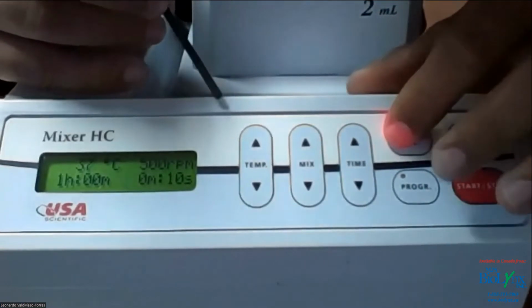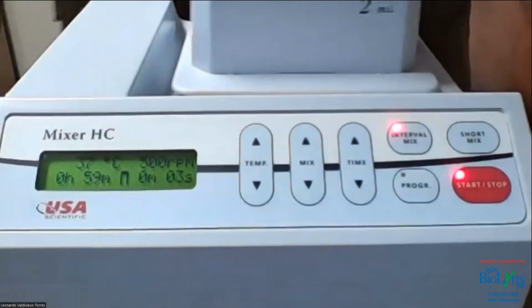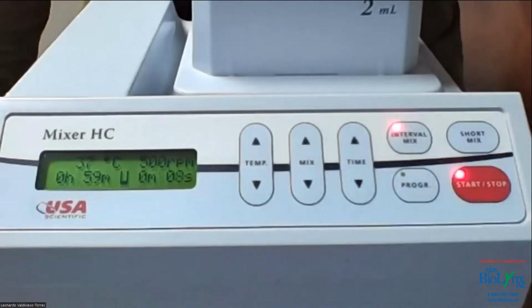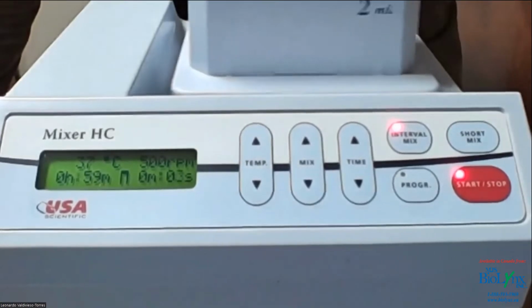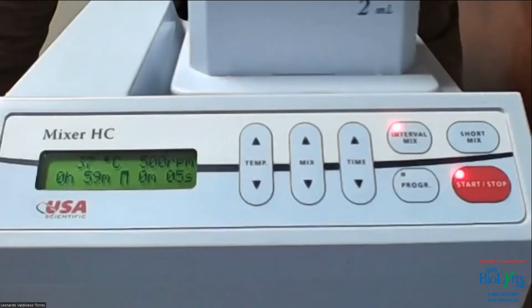Okay, so now we're gonna start the program. It starts by mixing. It's supposed to do that for 5 seconds. And then it goes for 10 seconds pause. In your case, if you were doing the experiment I used to do with the primary cells, every 15 minutes you would have it shaking for at least 1 minute. And it will be hands-free. And once the machine finishes, it beeps pretty loud, so you will be able to hear that your reaction is completed. So, any question?